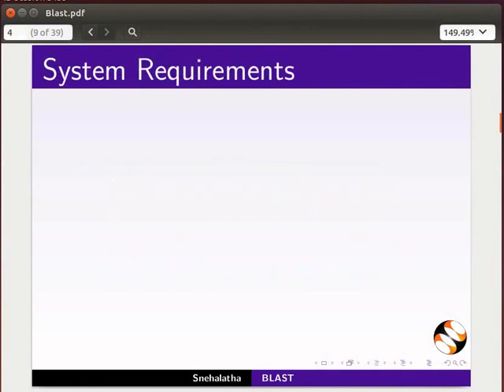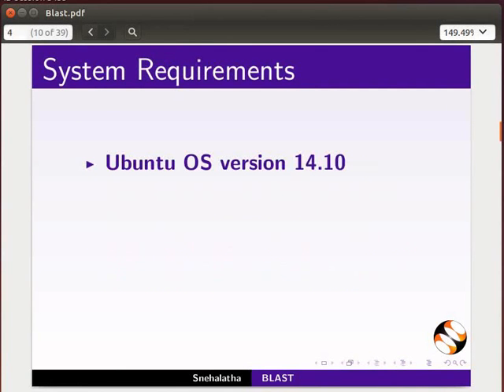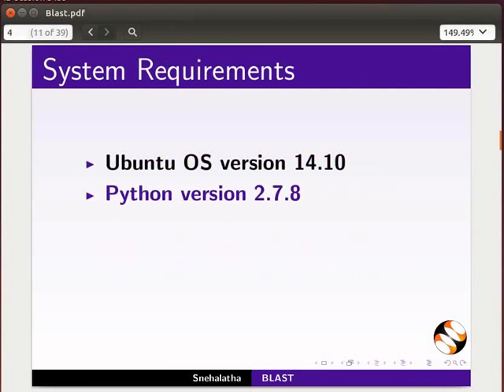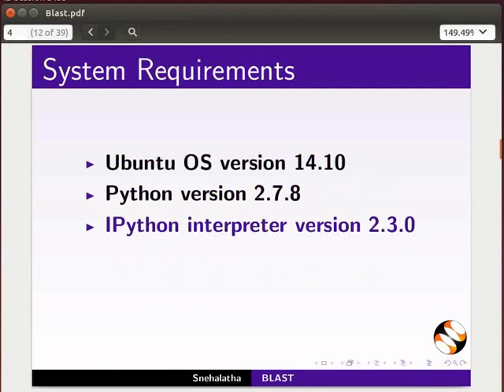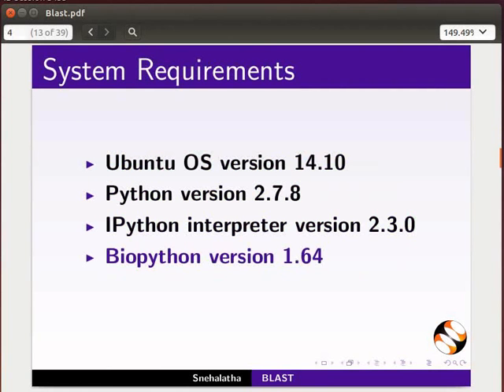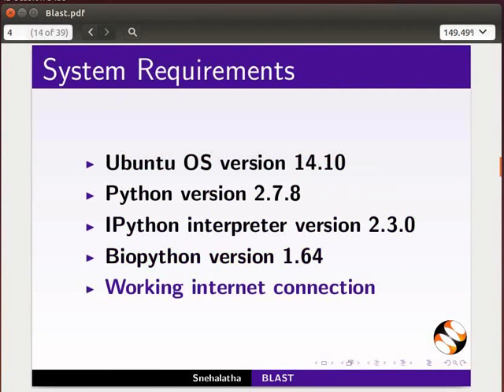To record this tutorial, I am using Ubuntu operating system version 14.10, Python version 2.7.8, IPython interpreter version 2.3.0, Biopython version 1.64, and a working internet connection.